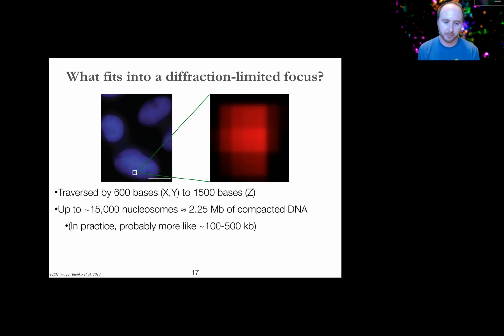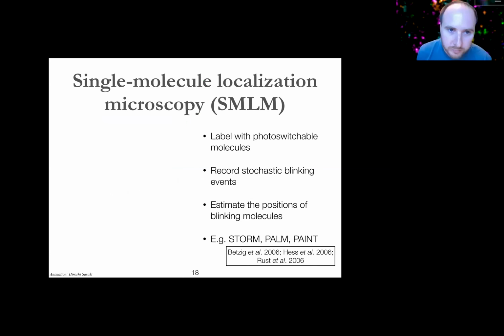But what this is telling you is that, and many proteins can fit there too, a lot of the length scales that are really relevant for biology that people are excited to understand, like enhancer promoter interactions and localized folding and gene bodies and things like that, that's going to be completely invisible no matter how much money you spend on your high numerical aperture objective or whatever else you can do to try to make your light collection as good as possible. The diffraction is just fundamentally bottlenecking things at this length scale of hundreds of kilobases or so in terms of our ability to resolve information.